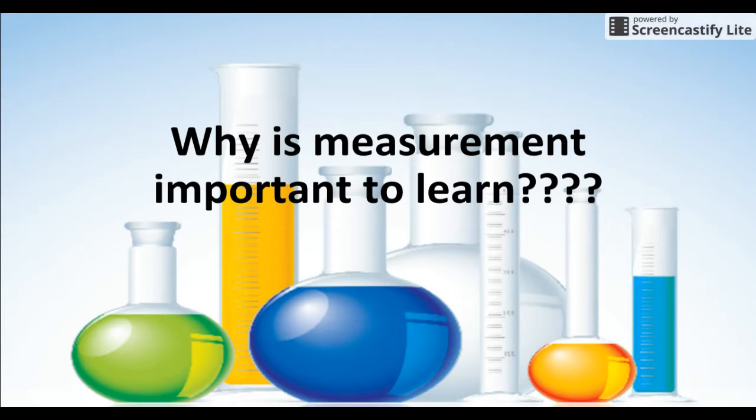Science is all about making observations, and oftentimes those observations require special tools. In the science lab, we use many different tools for many different things, such as observing the length of an object, its mass, temperature, volume, or even density.